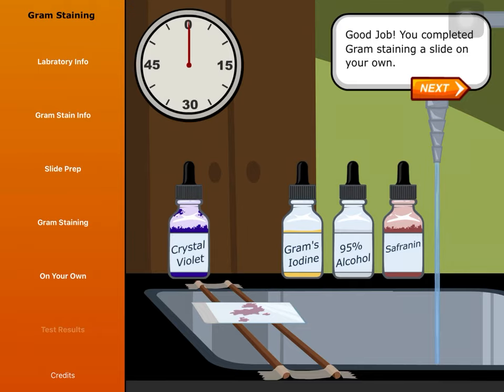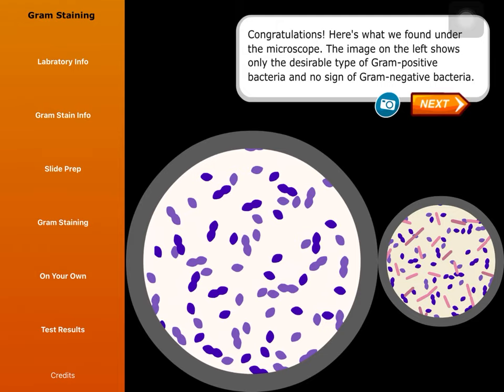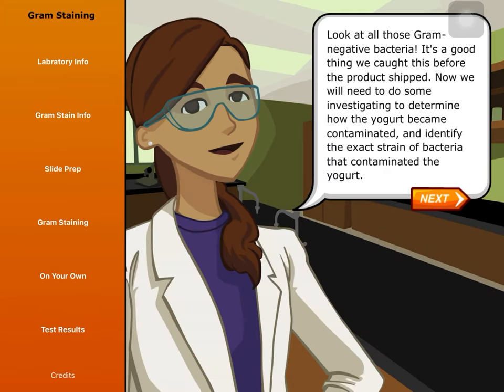Good job — you completed gram staining a slide on your own! Here's what we found under the microscope. The image on the left shows only the desirable type of gram-positive bacteria and no sign of gram-negative bacteria. The one on the right is contaminated — notice the pink-stained bacteria; those are gram-negative. These contaminants include undesirable bacteria that could be harmful. It's a good thing we caught this before the product shipped. Now we will need to do some investigating to determine how the yogurt became contaminated and identify the exact strain of bacteria.